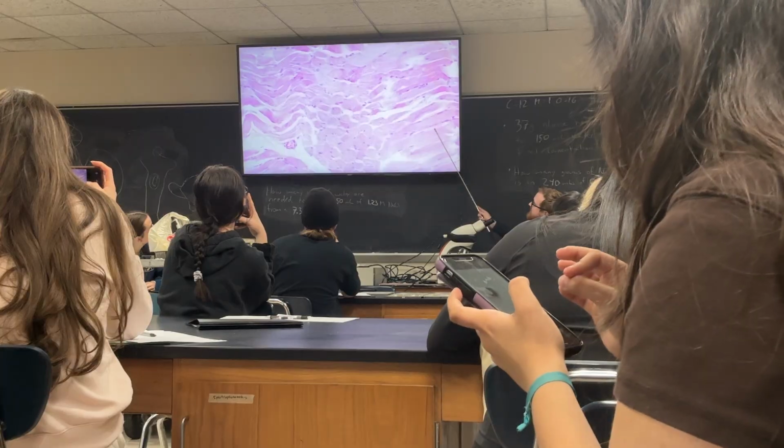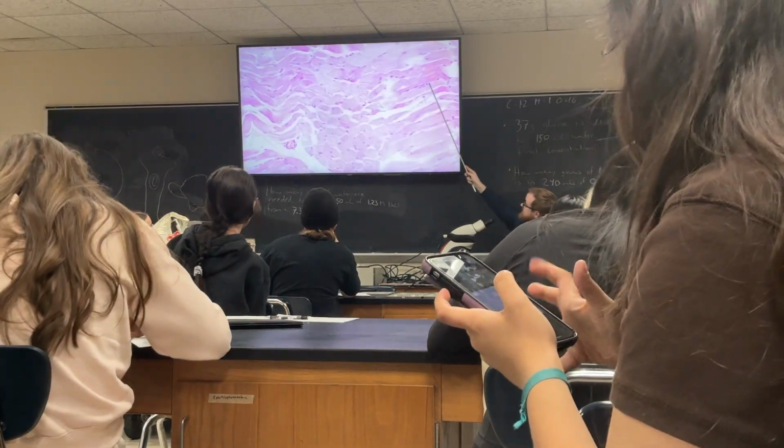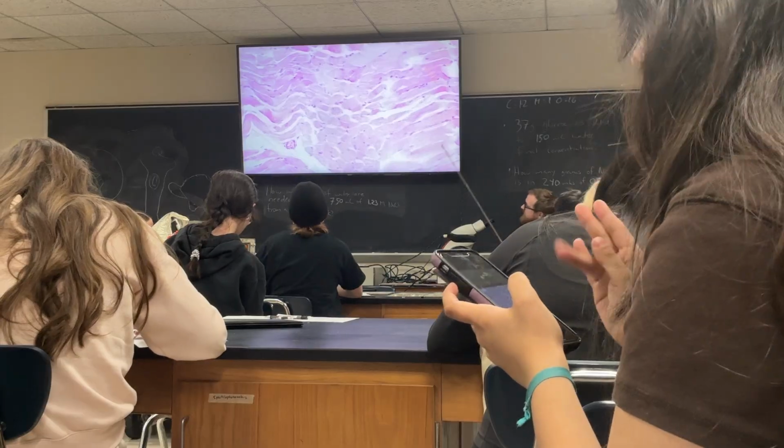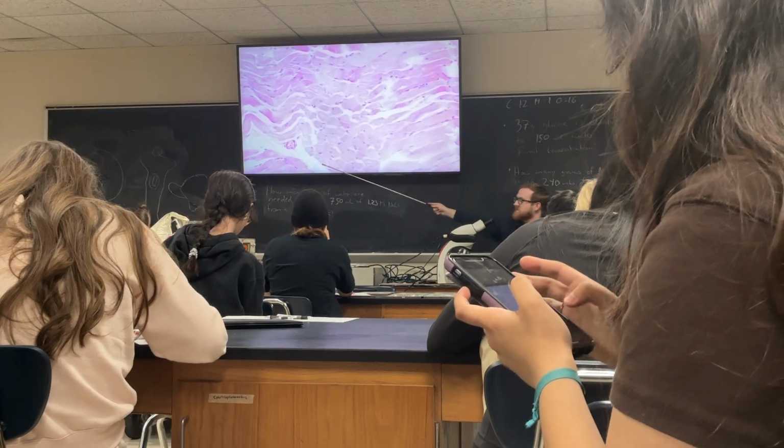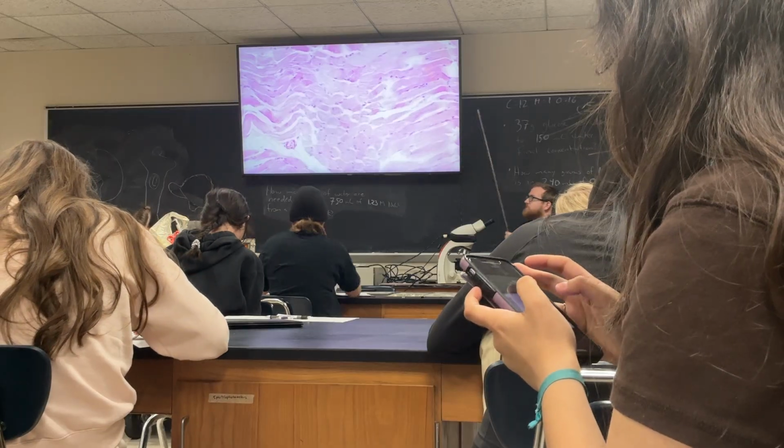Some of these are little capillaries, but here you still see those nuclei squished to the sides. So this has to be skeletal muscle. This part of the muscle, this is probably tongue. You have a lot of skeletal muscles going in random directions in the tongue.